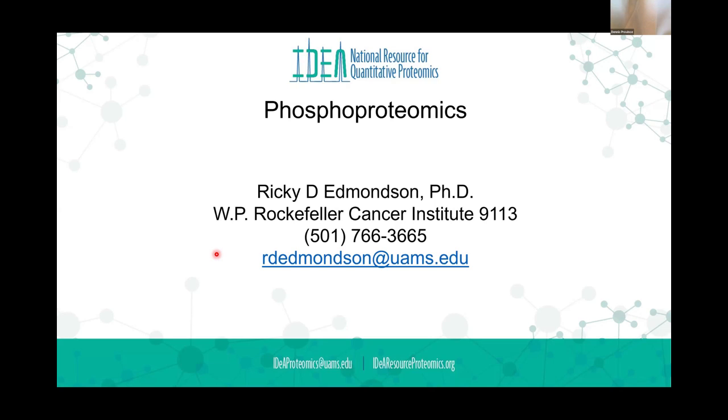I'm going to talk about phosphoproteomics. Mass spectrometrists have been talking about phosphoproteomics about as long as people have talked about weather, and you can talk about it, but you can't do anything about it. And that's the way it was for a number of years in mass spectrometry. A lot of people talked about it, not many people did anything about it.